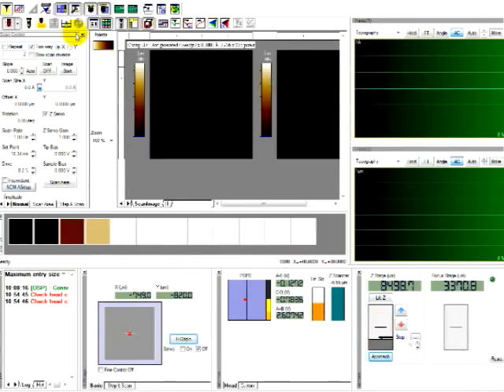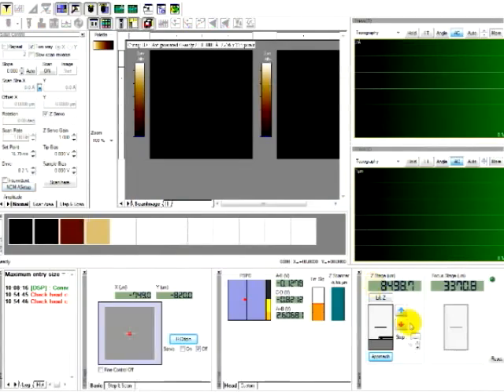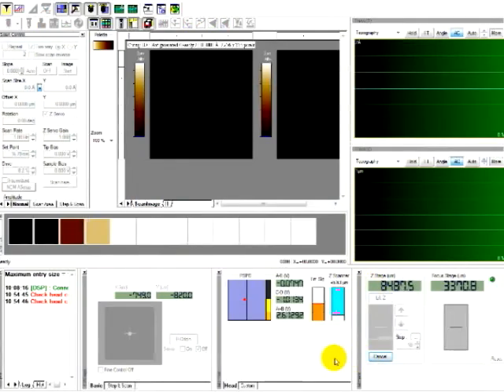Okay, and then you can click frequency sweep and the setup window, and you can just refresh it over there. As you can see, set point has been reduced from 18.34 nanometers to 16.8. Then click done. Make sure the amplitude feedback is still checked. Done, and reapproach the sample.